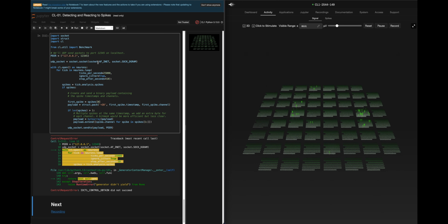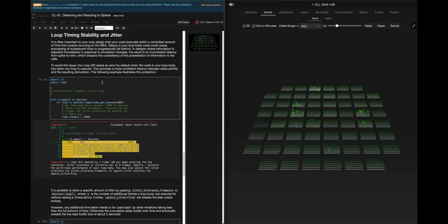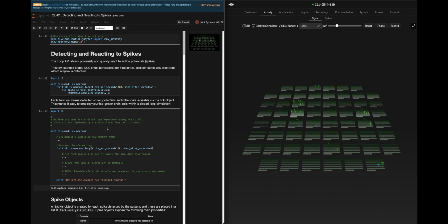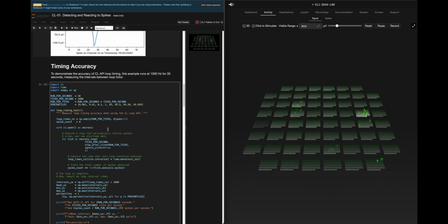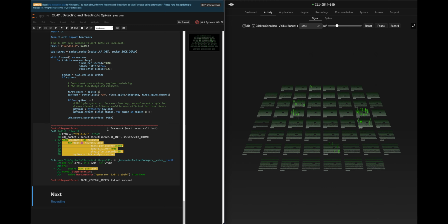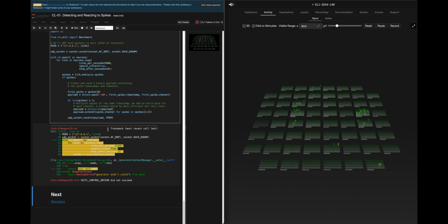This just gives you a concept of why you need the API and why it makes sense. How is it saving us a lot of time, not just in the program, but in bookkeeping and having good data sanitation? That's what the API is designed for.